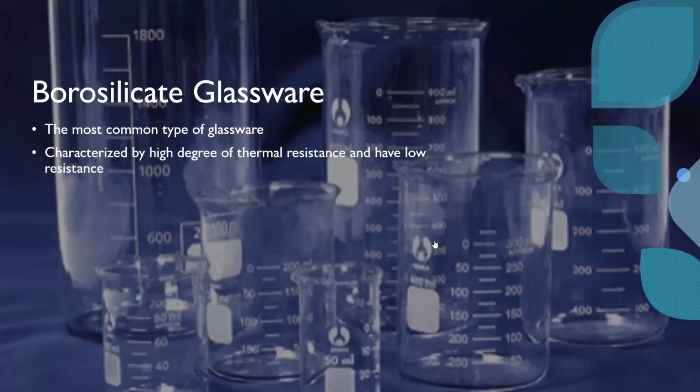Number one, we have your borosilicate glassware. Take note, guys, that of all the glassware that we have, borosilicate glassware is the most common type. This is what you were using even in your junior high school or senior high school days, because it is common.